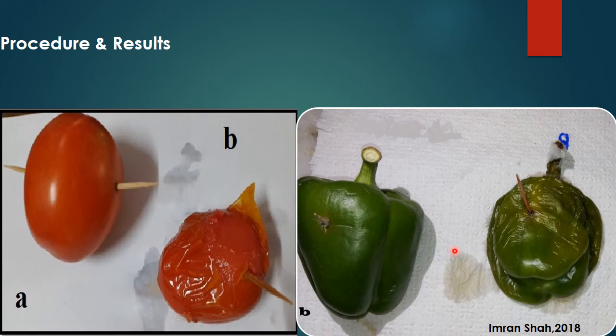This study gives you an idea of whether the bell pepper or tomato fruit is resistant or susceptible against Erwinia carotovora or Pectobacterium carotovorum. It is a very simple experiment but it gives excellent results and is used in different laboratories to assess the virulence of the pathogen as well as the resistance of the vegetable against the pathogen. Only genetically resistant plants have the ability to stand against the pathogen, while vegetables that are not genetically resistant will show soft rot symptoms.